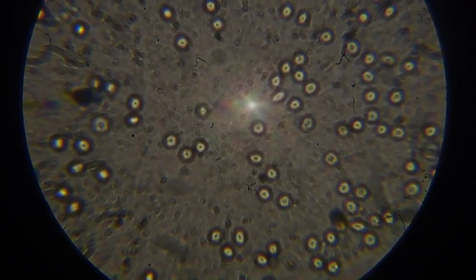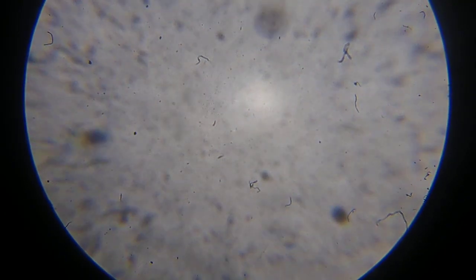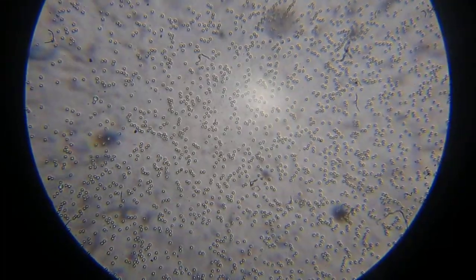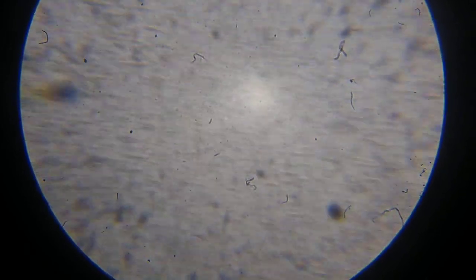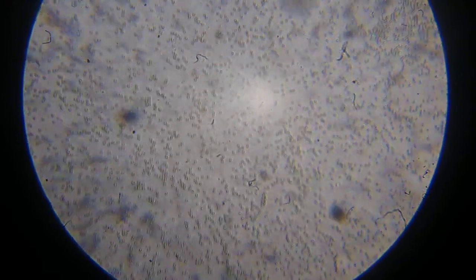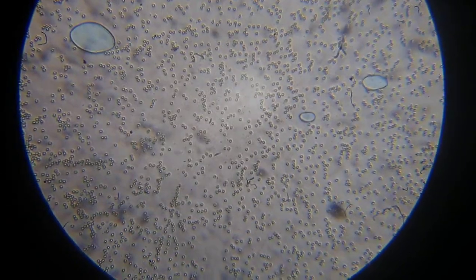Let's try to find a neo in the vicinity of the red blood cells to see how they differ, or what we suspect to be neo. We need to first find the candidate. It was actually easier with the blue coloring, methyl blue. It's much more difficult without the blue coloring.